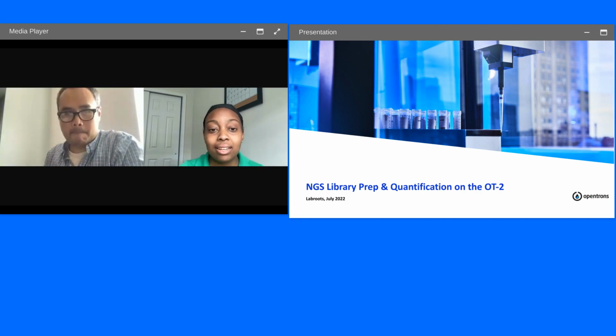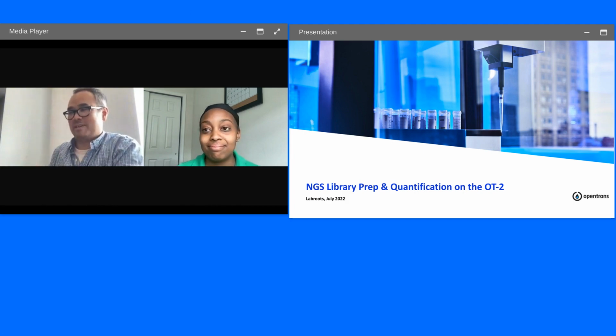Absolutely. What is the Python code to pick up a single tip using a multi-channel pipette head? Very specific to the Python API here, but how have you accomplished this in library prep protocols? There's two different ways. Again, I'm mostly new to Python, but I was able to jury rig a tip pickup by just setting a bit of physical offsets. So you have to make certain the deck is clear.